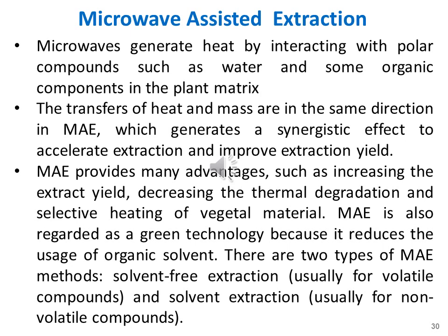The application of microwave assisted extraction provides many advantages such as increasing the extract yield, decreasing the thermal degradation, and selective heating of the vegetal material. Microwave assisted extraction is also regarded as a green technology because it reduces the use of organic solvent. There are two types of microwave assisted extraction methods: a solvent-free extraction usually for volatile compounds, and solvent extraction usually used for the non-volatile compounds.